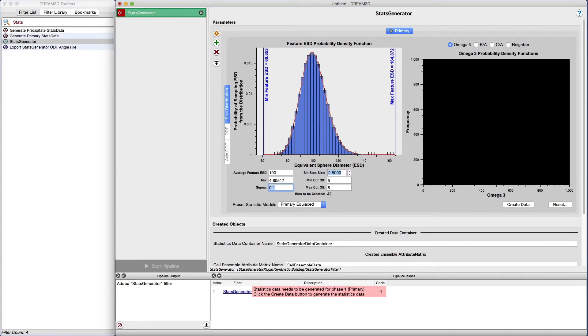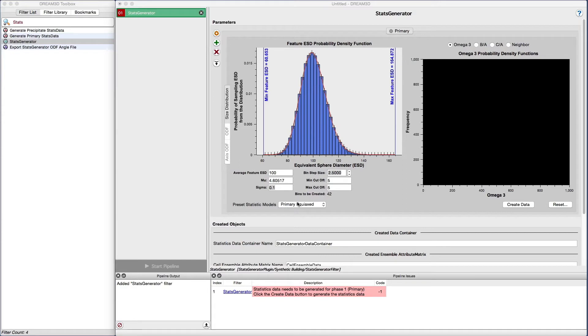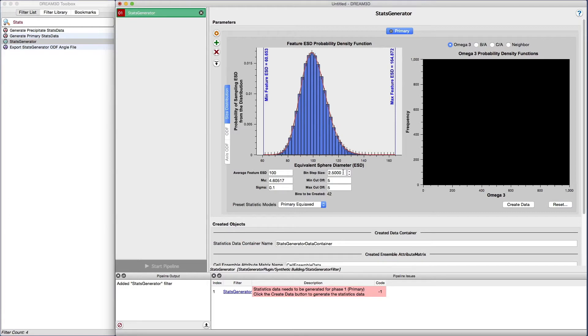We have found that just 7 to 10 bins is sufficient to get good results. We want to adjust the number of bins to a lower value, so we adjust the bin step size to a slightly larger value. Let's try a bin step size of 12.5. There, that looks much better.